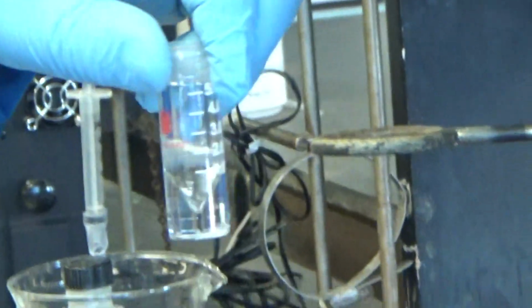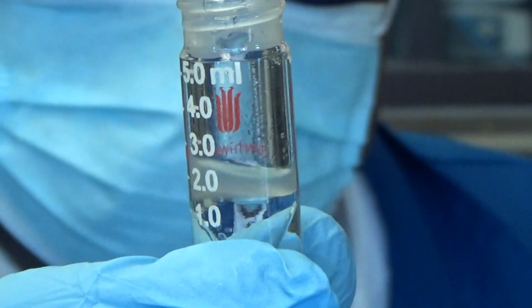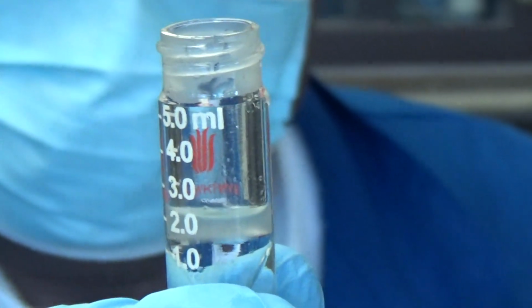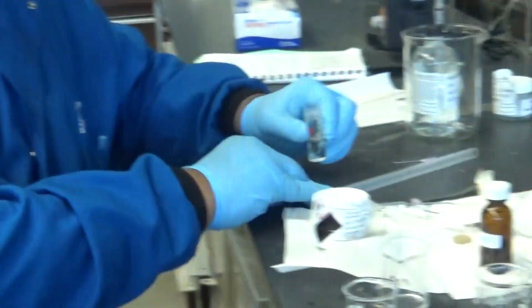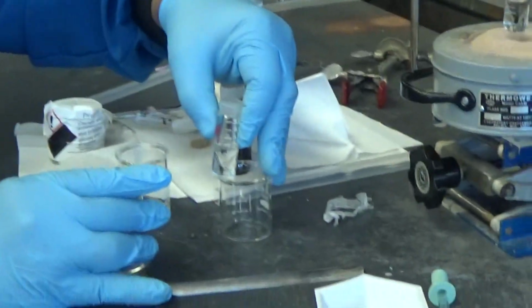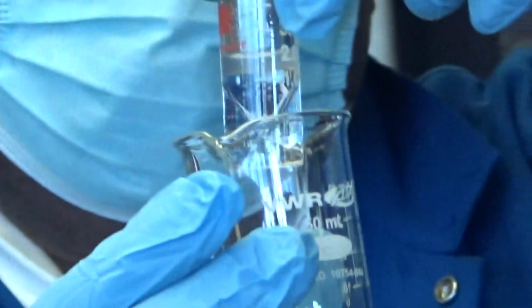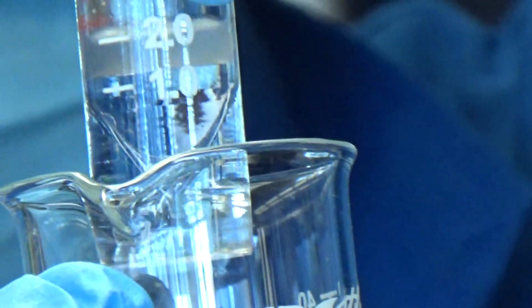1 milliliter. Okay, so now it's almost like a little mini separatory funnel, with aqueous on the bottom and organic on top. If we want to suck up the bottom, we just use a pipette, as I did. So we are going back to here. Hold on to it so it doesn't fall, just to avoid technical mistakes. You don't want the bottom layer. You want the top layer, which is the organic.